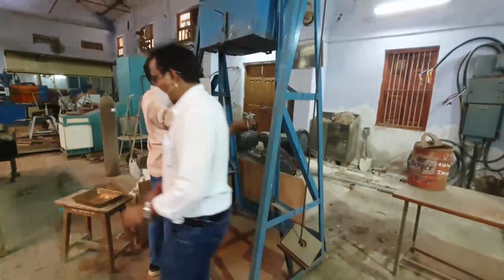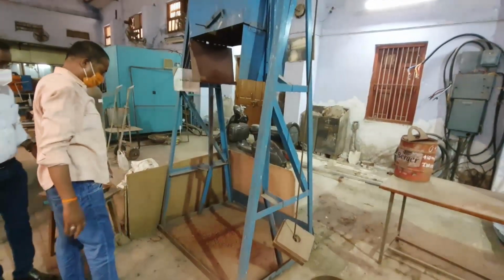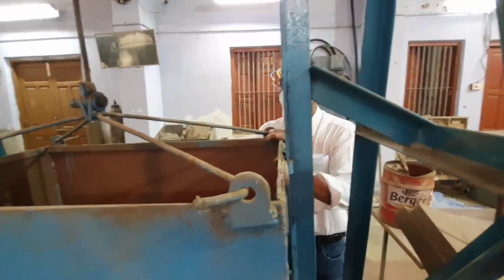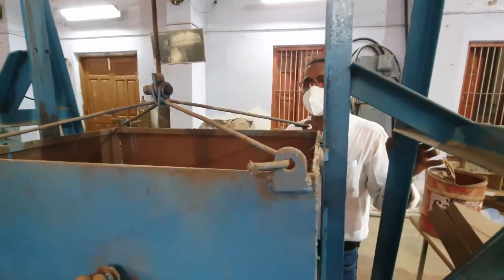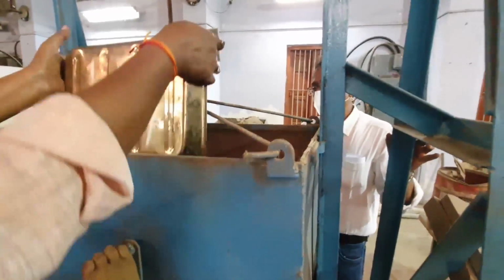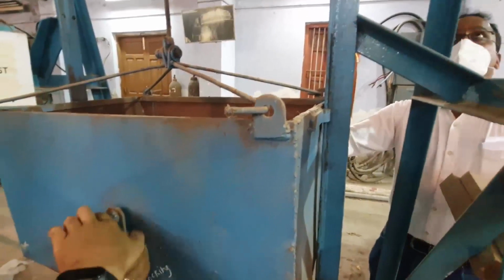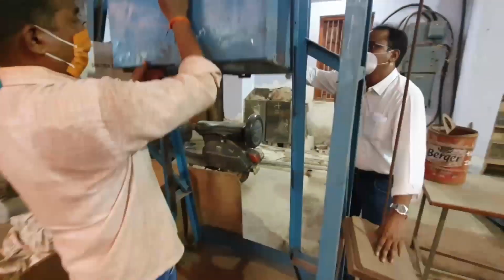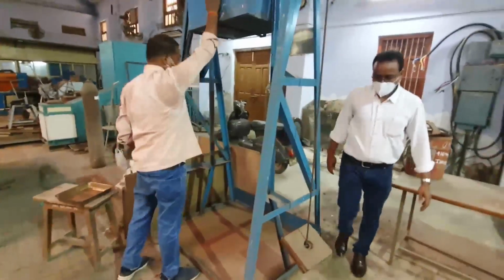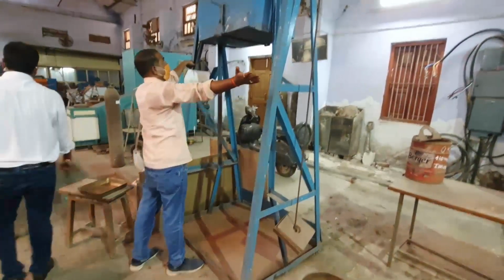Third time we are opening the door. This is the fourth time. Minus 20 plus 10 mm iron ore again. We are putting into this. And we are opening the bottom door.